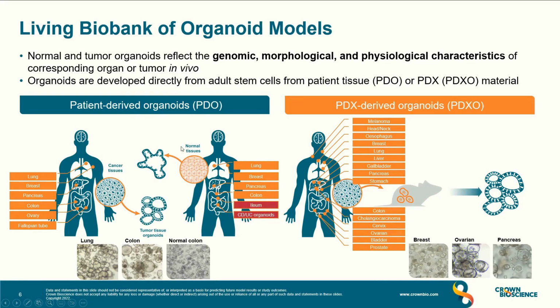In this case, we don't use the mouse models to expand the organoid models, which comes with the benefit of quick isolation and growth. But using these mouse models is actually also very beneficial, because the moment that the biopsy hits the mouse, it even better recapitulates the tumor of origin, and these isolated organoids already are well validated to use in vivo if you want to use the same organoid lines for in vivo follow-up.